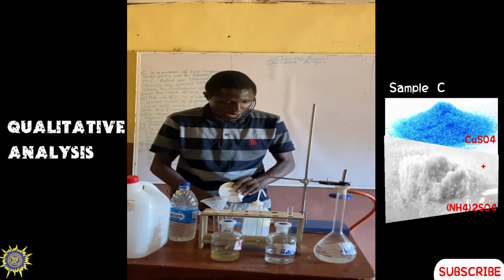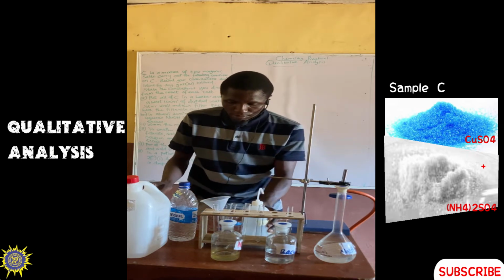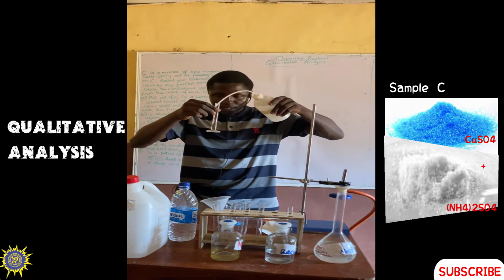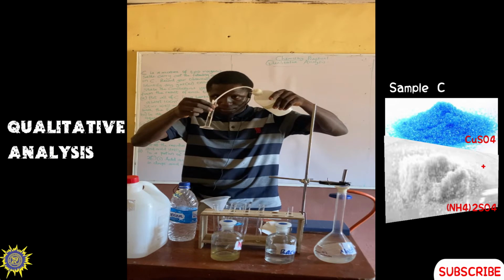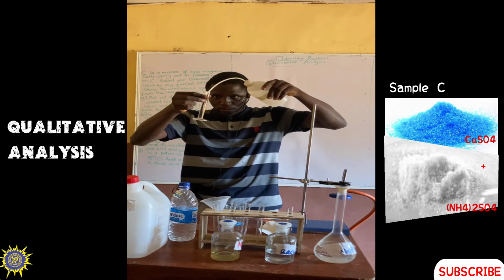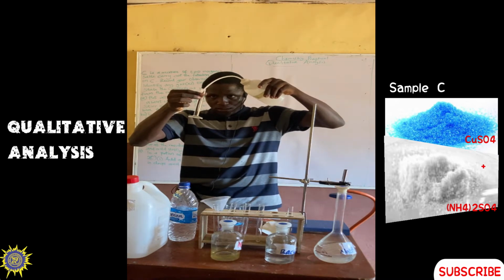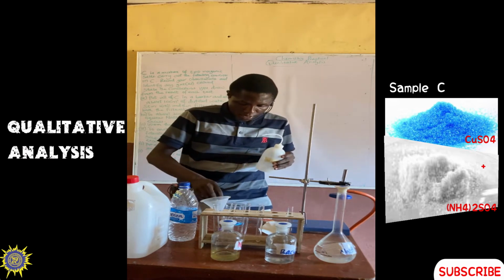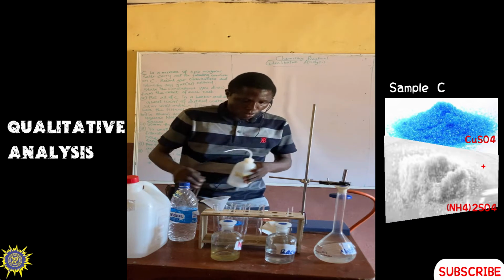Then we add 10 cubic centimeters of distilled water. So, I have 10 cubic centimeters of distilled water here. That is that.